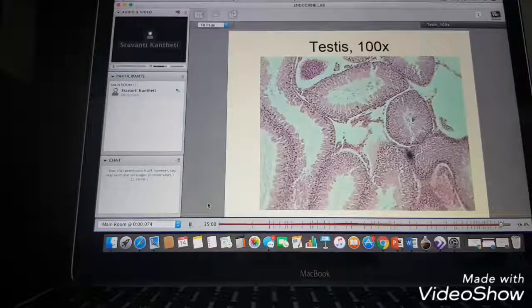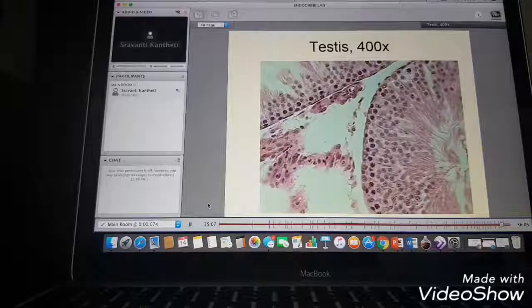So that's what I want you to look at, which are these here, the ones that have the nuclei that you can see as darker dots around. And this is a brighter and more magnified view, and here you go.